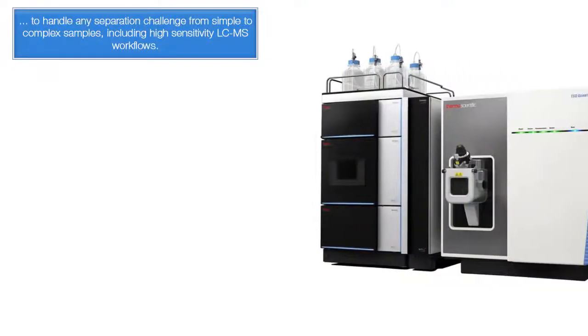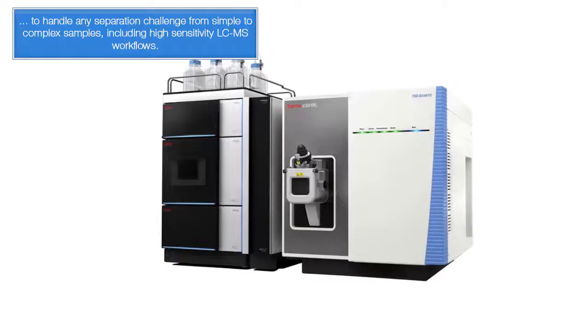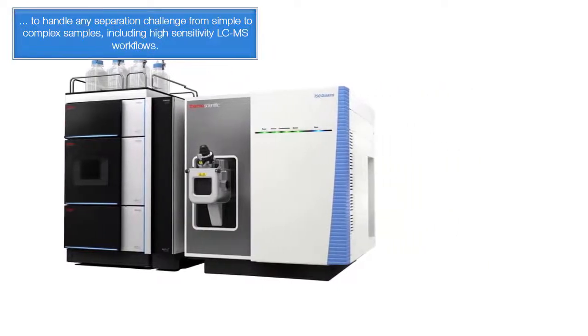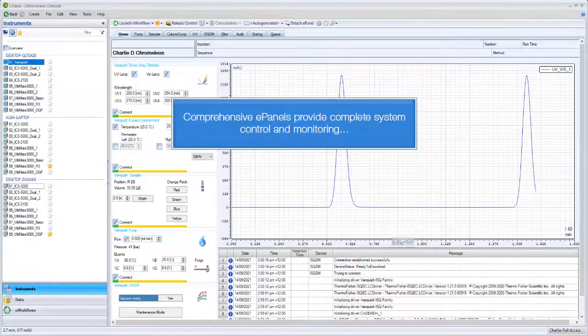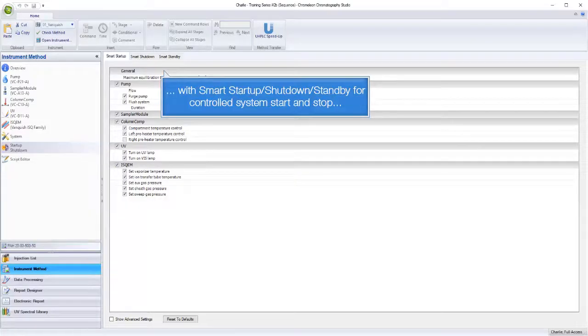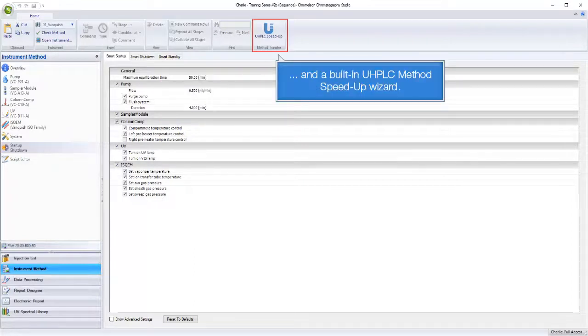These systems handle any separation challenge from simple to complex samples, including high sensitivity LC-MS workflows. Fully controlled by the gold standard Chromelion Chromatography Data System, comprehensive e-panels provide complete system control and monitoring, with smart startup, shutdown, standby for controlled system start and stop, and the built-in UHPLC method speed up wizard.